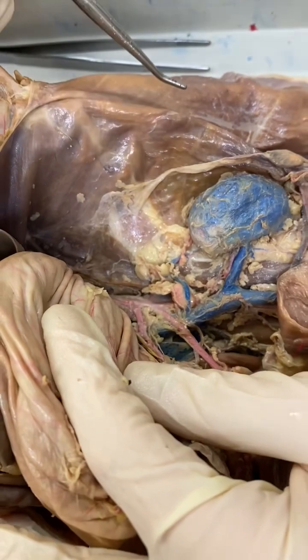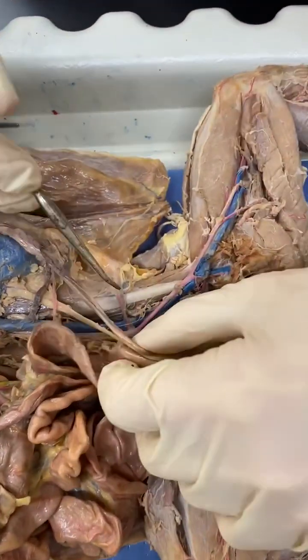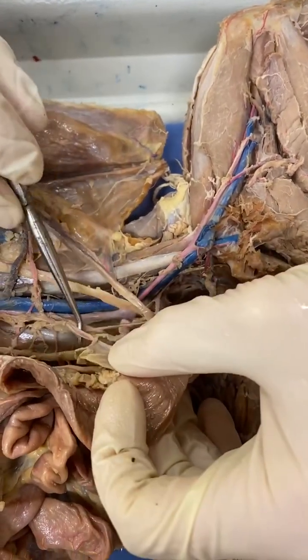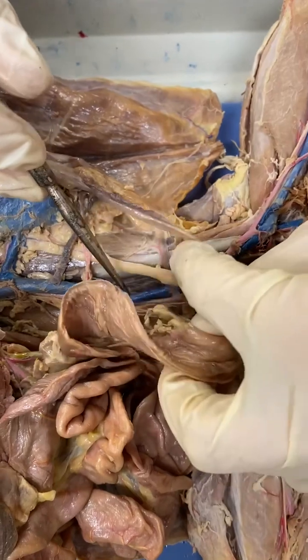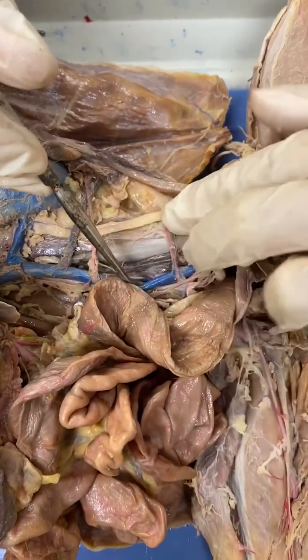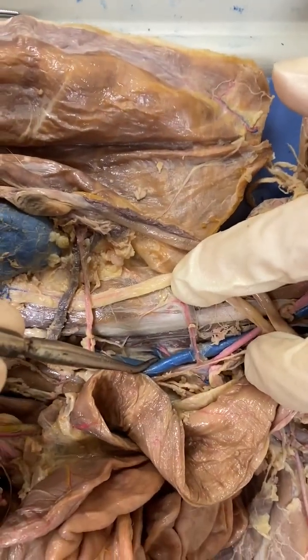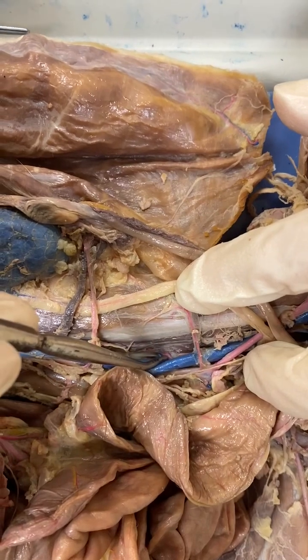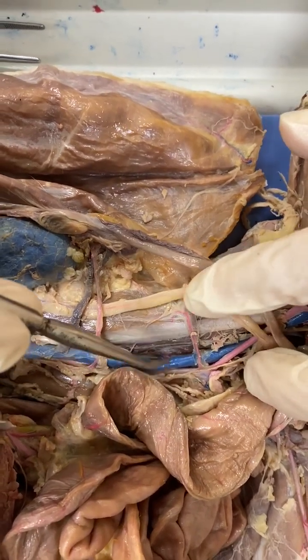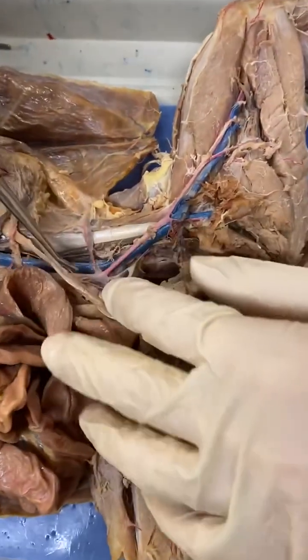We have the deep iliocircumflex artery. To find the deep iliocircumflex, it's helpful to go from the caudal mesenteric and then go just a little bit further down. Peel back the posterior vena cava, and those are the deep iliocircumflex artery and vein. Very small. External and internal iliac artery and vein.